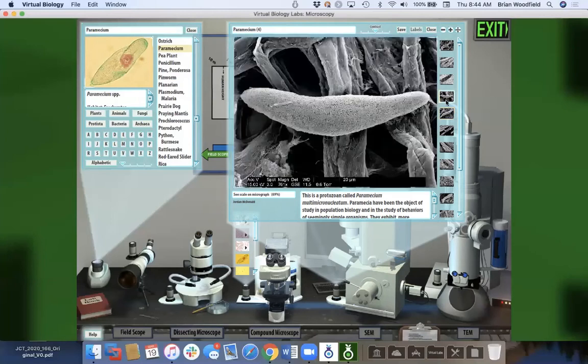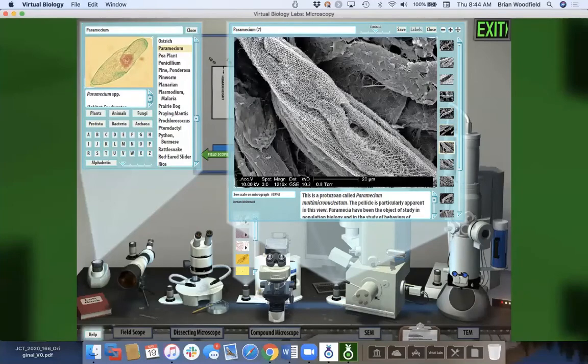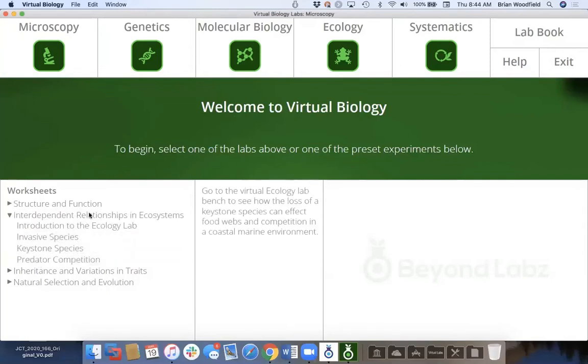So to me, as a non-biologist, I just think this is so amazingly cool to see this kind of resolution and then see which tool is used for the right thing. So we have worksheets that use this to talk about microscopy and how to use it and the different pieces of information. So we have a database of about 3,500 images that they use. So this is our high school version. All of our worksheets that we have for this are organized by NGSS.